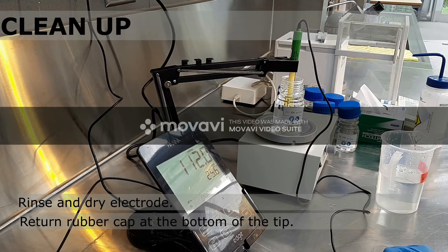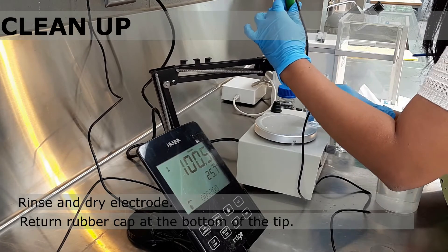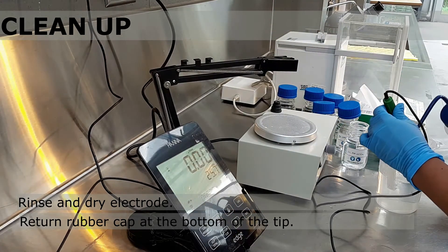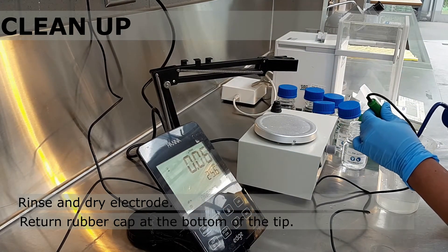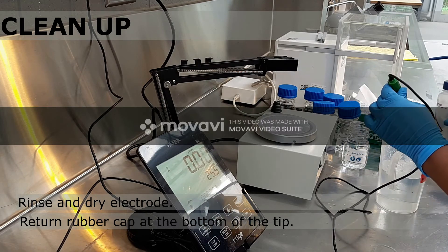Now that you're done measuring the EC of your solutions, remember to clean after yourself. Only store clean electrodes with the rubber cap on. If you have any questions, please don't hesitate to reach out to any of the UTM Research Greenhouse staff.